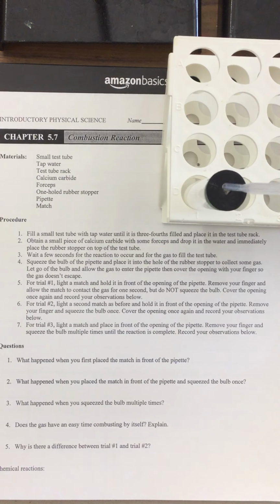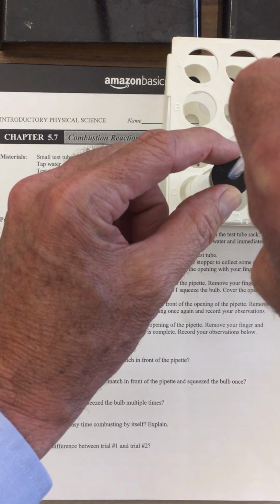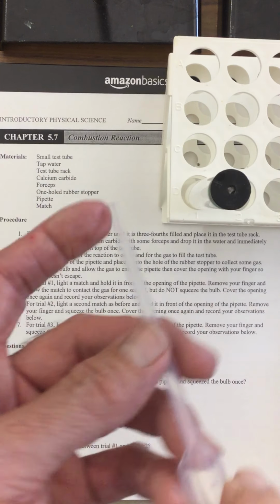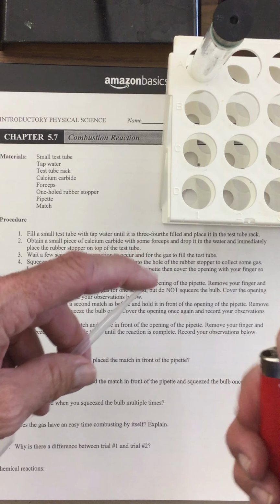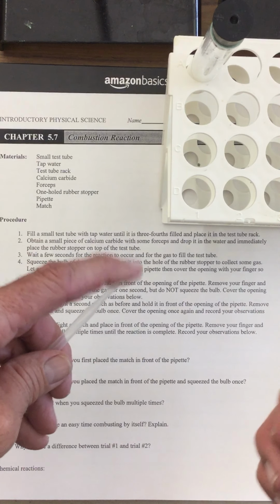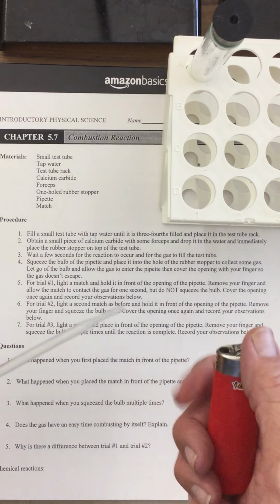So I'm going to put in the pipette, and I'm going to now extract the gases from there, and I'm going to cover this up. So I'll put this over here. And now I'm going to see, does this light? Okay, nothing really happened with that. So I'm going to try to squeeze it now.